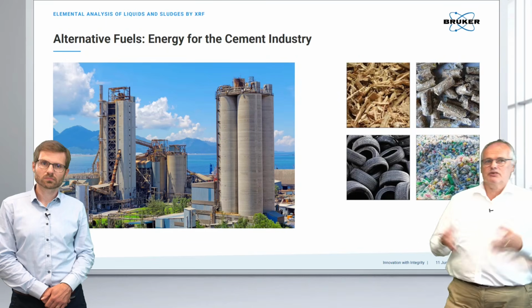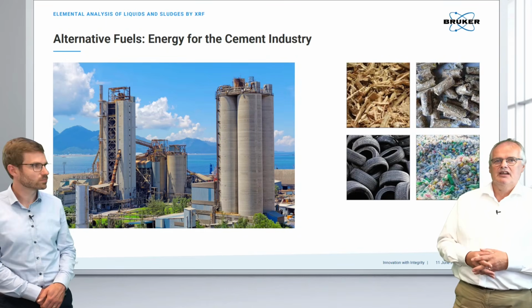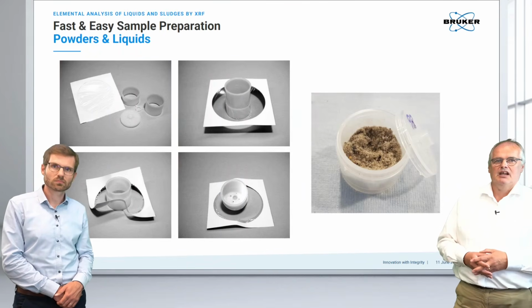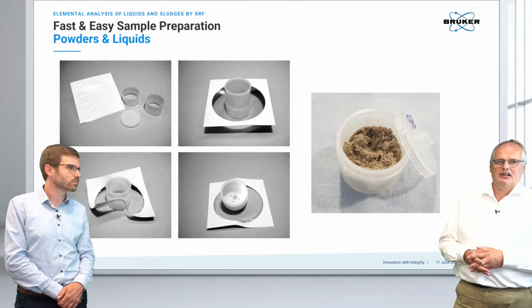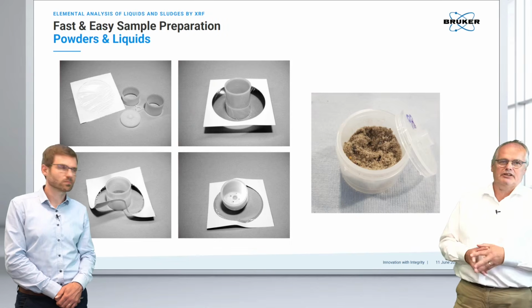And this can really be a surprise package. One day this can be okay, the other day suddenly it's out of spec. If it fits, you can go into a liquid cup, here shown with wood chips. When you want to grind those soft materials, a freezer mill helps, a cryogenic mill, or a normal mill with liquid nitrogen.